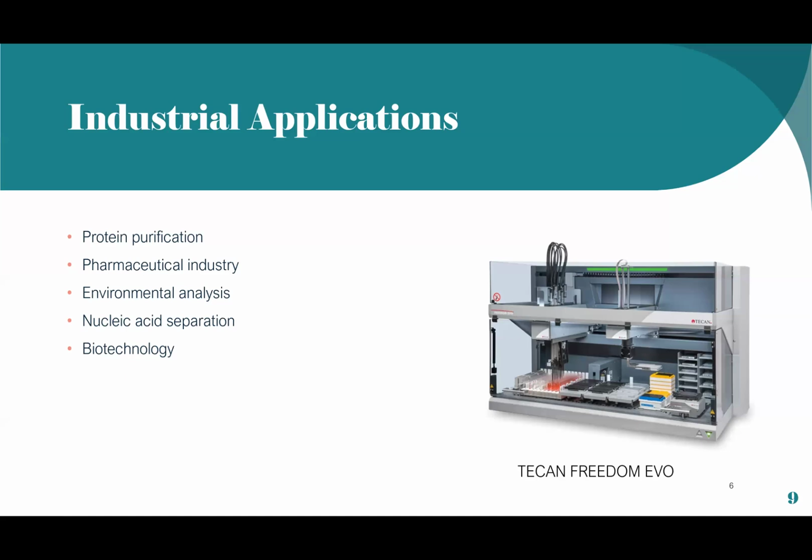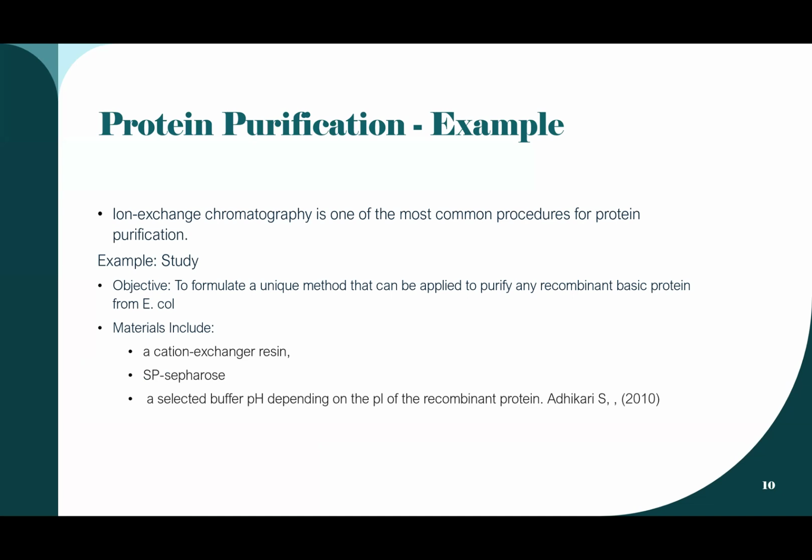And so the way we go about this is that I'm currently conducting resin screenings, and this particular instrument helps me build the plates that I need that will do the wash and elution steps and flow-through plates for my resin. So that's what I'm going to expand on. Protein purification is one of the examples that I chose to talk about because I'm familiar with it.